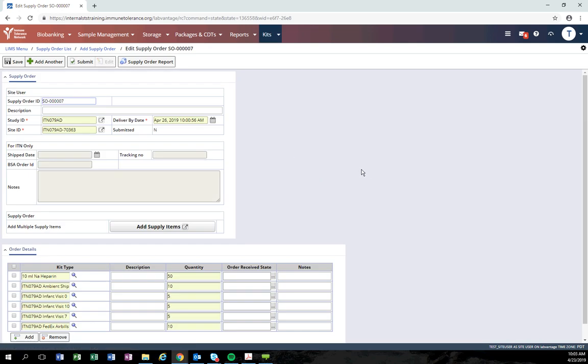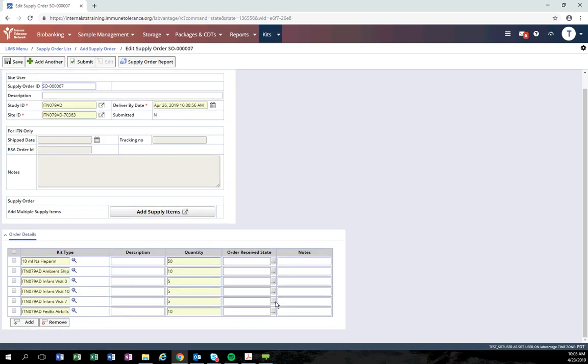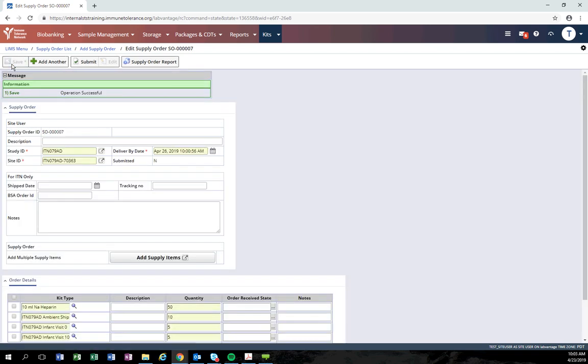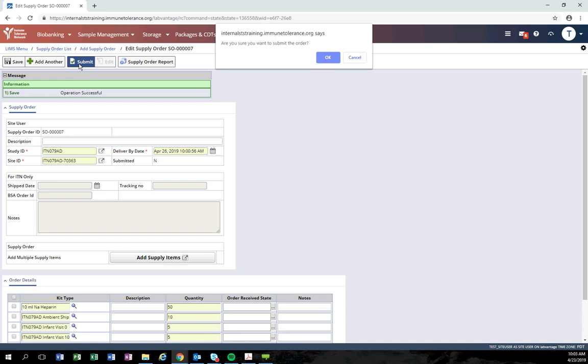You can then edit the deliver by date if you need to, modify a quantity, add a new supply item, or remove an item as appropriate. After you've made the change, be sure that you save the changes and resubmit the order.